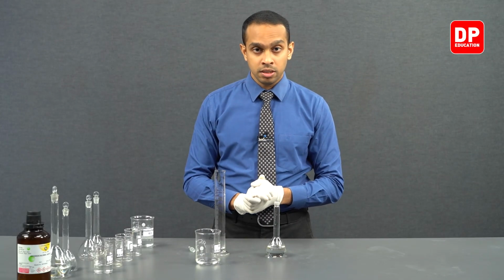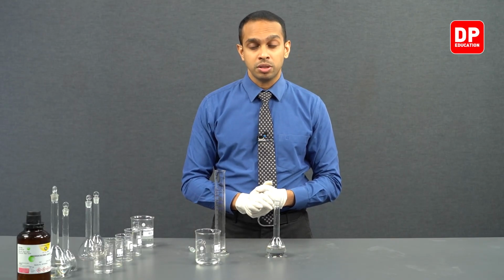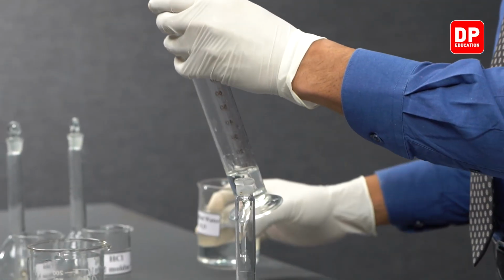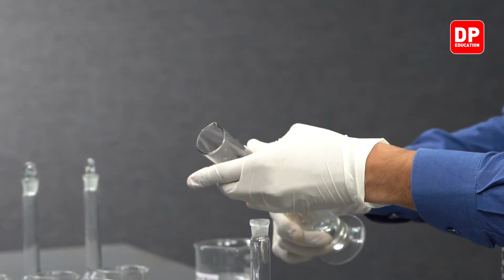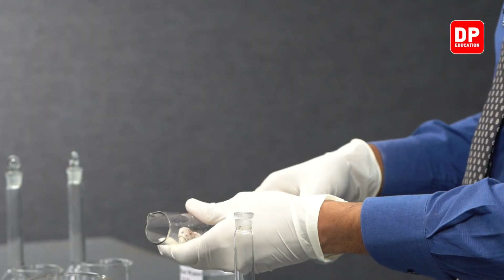After transferring this 60 ml of 1 mole per decimeter cubed concentrated HCl, we can wash our measuring cylinder and transfer that water also into the volumetric flask.